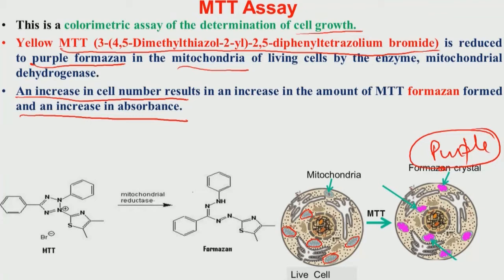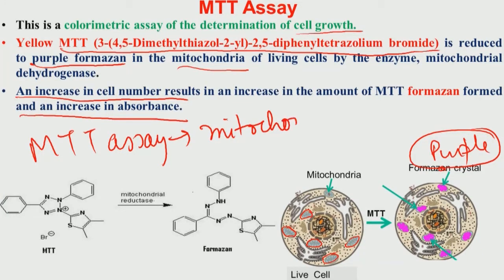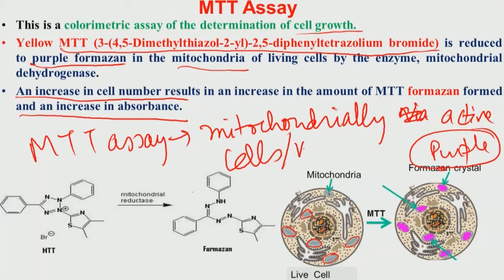Therefore, the MTT assay essentially determines mitochondrially viable cells or mitochondrially active cells, or in one word, it determines the number of viable cells in solution.